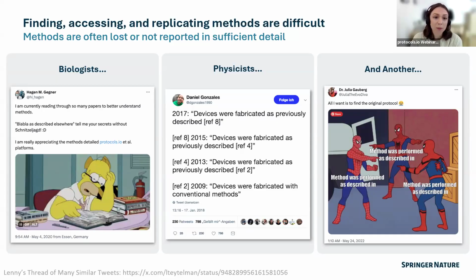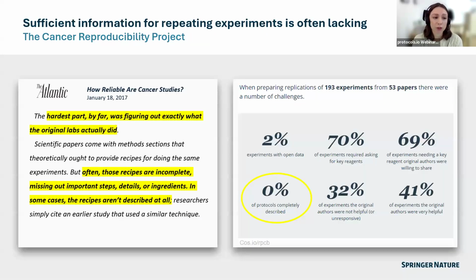And so, I'm sure many people on this call today are familiar with that concept, and it's been looked into in greater detail. There's a very interesting project from the last 10 years. This was the Cancer Reproducibility Project. The goal there was to take 50 published, high-impact and important papers in cancer biology and see if it was possible to replicate the results when performing those experiments again.